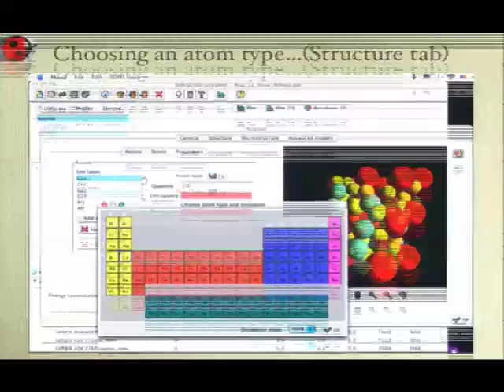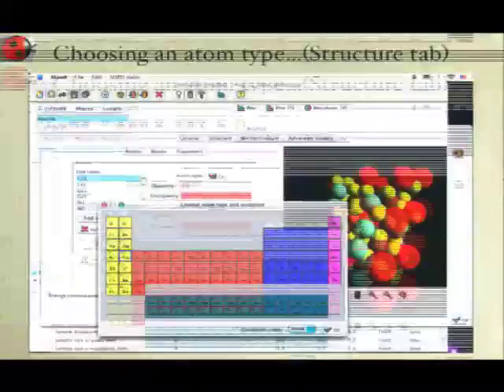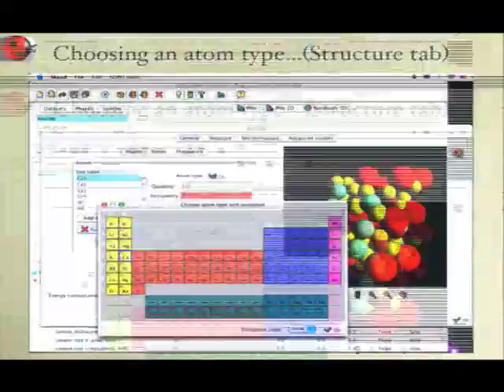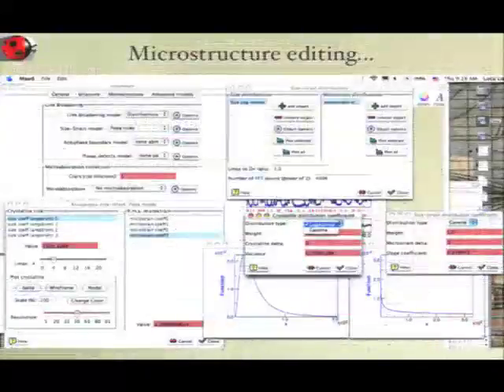Okay, for the atom, if you are going to put your structure in MAUD, you choose the atom, whatever. Actually, this is old. We now have, not only can you choose the oxidation state, but in Los Alamos they asked me to also add the isotope, because they deal with neutrons, and neutrons are sensitive to the isotope also. Okay?